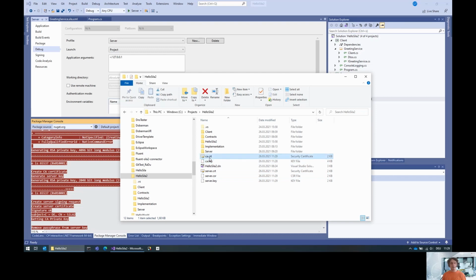The CA certificate is basically something that describes the certificate authority, which is public. And this file is something that you basically have to store in some secret location if you want this certificate authority to have any value. So normally you should store that somewhere in the safest place that you have in your company network. For now, we'll just leave it here.